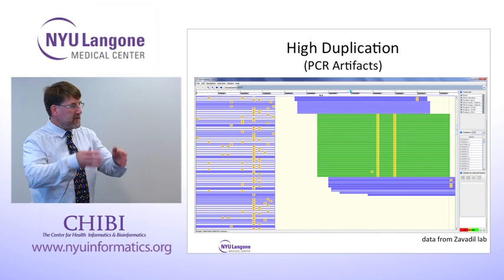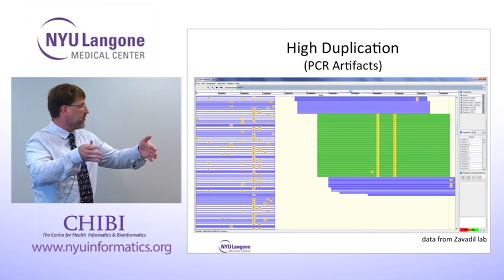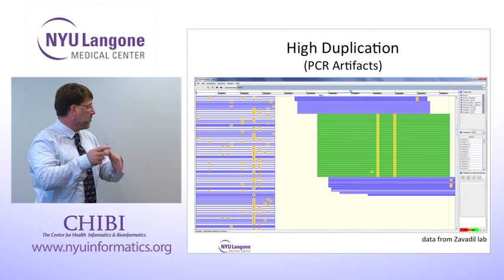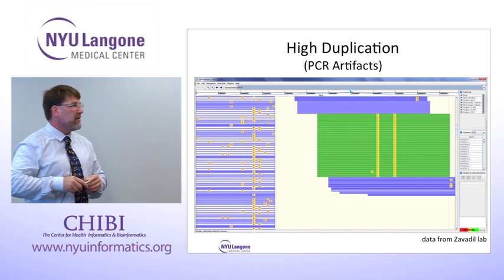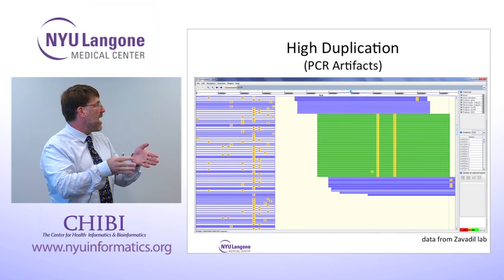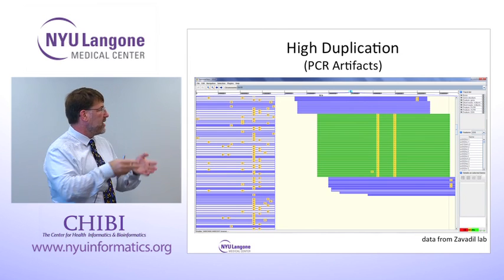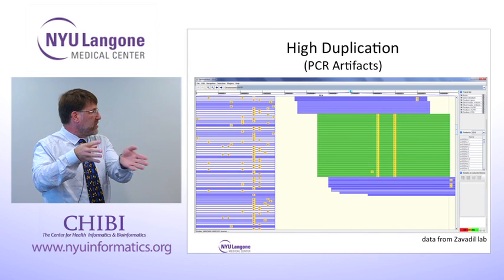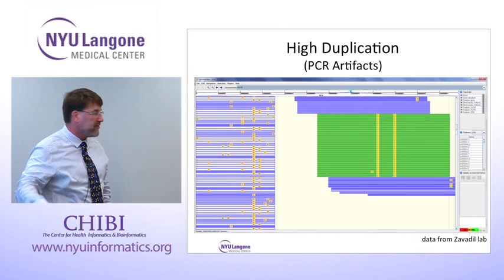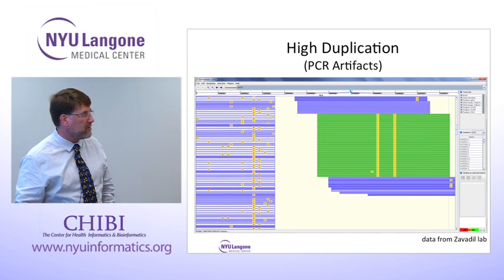Yeah, well, what happens is if the seed matches, if you get less than 2 mismatches in the first 32 bases, then the rest of the alignment is tacked on, even with more mismatches. So if the mismatches are scattered throughout and you have no chunk that has fewer than 2 mismatches, then the read gets thrown away. But if there's a chunk that matches and the mismatches are at the tail end, which you see often because the quality tapers off, which is what you're seeing here. But again, these may be some sort of duplicates as well.